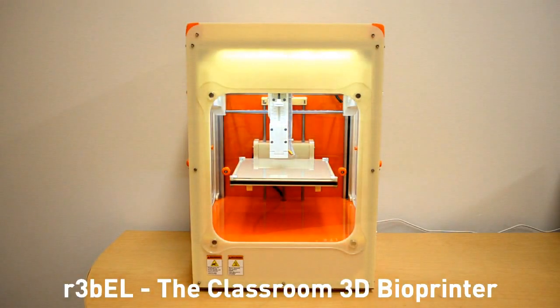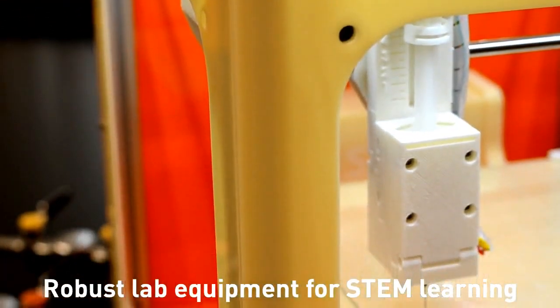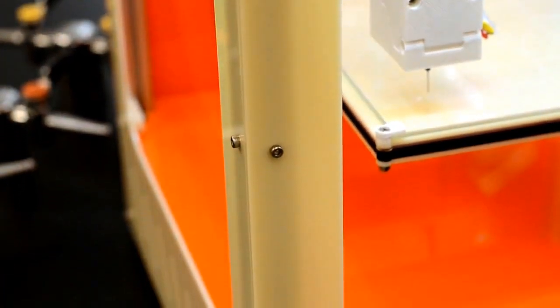SE3D Education presents REBEL, the innovative classroom 3D bioprinter. REBEL is a robust lab equipment that can be used to support STEM learning in and out of the classroom.